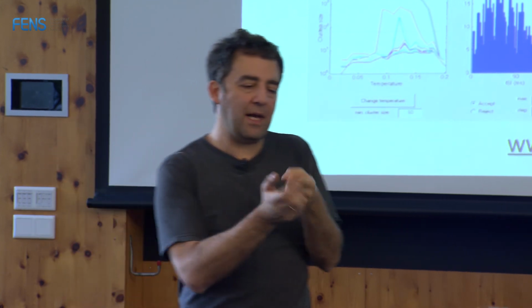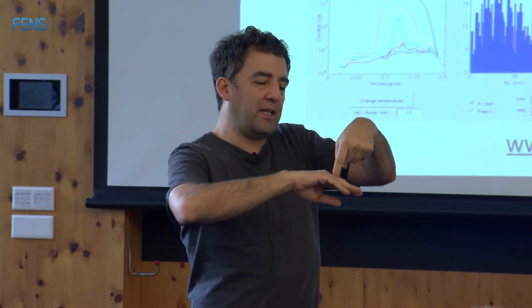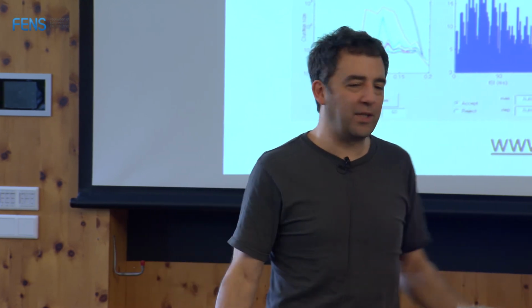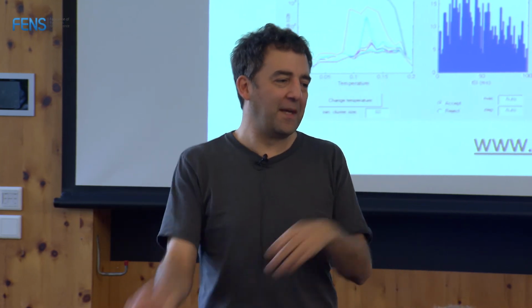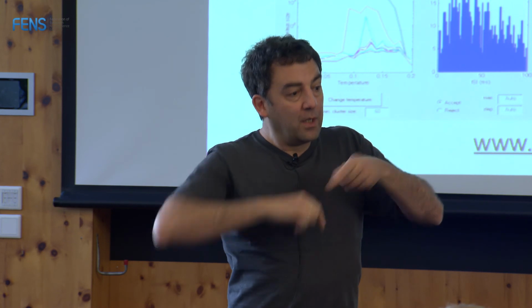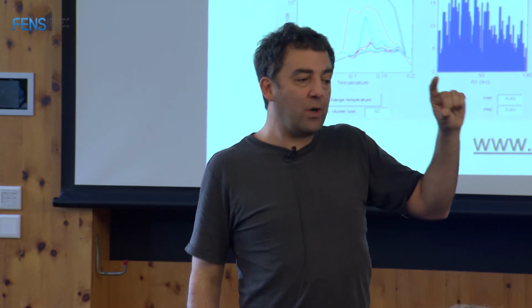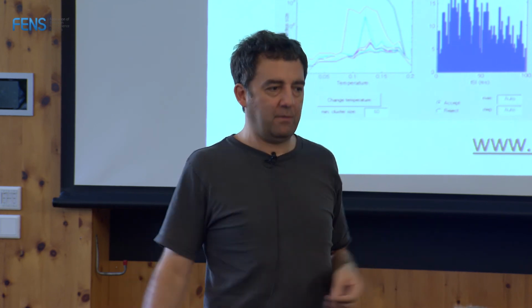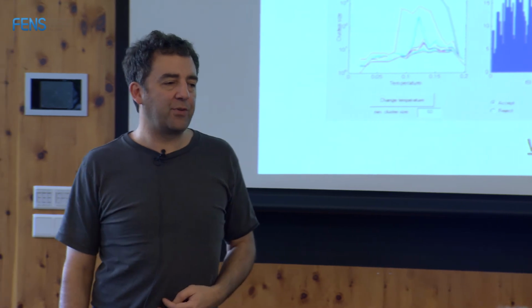It's maybe like when you put an electrode inside the brain and the brain retracts and moves slightly. You have to wait. You shouldn't start recording immediately. How long should you wait? About as long as it takes to get a coffee. That's what every neurophysiologist will do. They go for a coffee, they finish the coffee, and then they start recording. But if the brain still moves, you will see changes in the spike shape. As long as they are smooth and you can track them, you can more or less safely say it's the same neuron. But in principle, you never have ground truth. It's very hard.